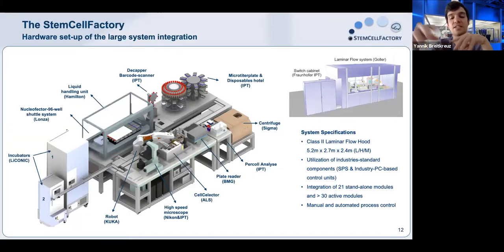But we will present all of these single modules step by step during the next minutes. In general, as you can see on the right side, the entire unit is encased in a clean room cabinet. So next, Bastian will show you how it all began.